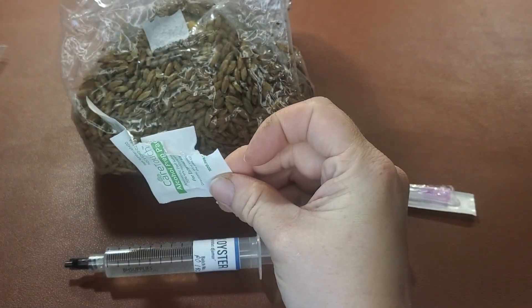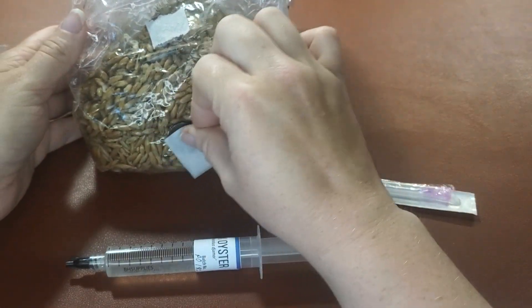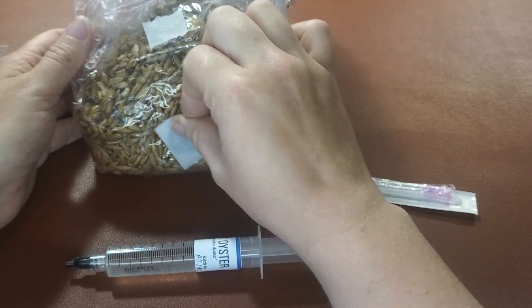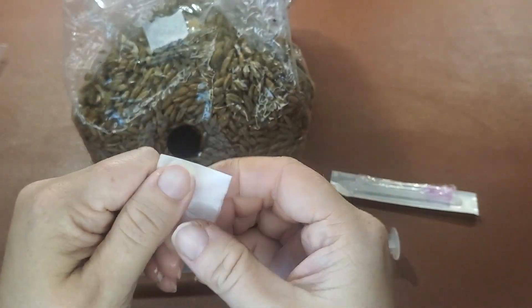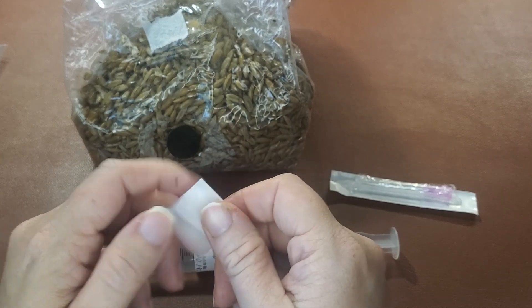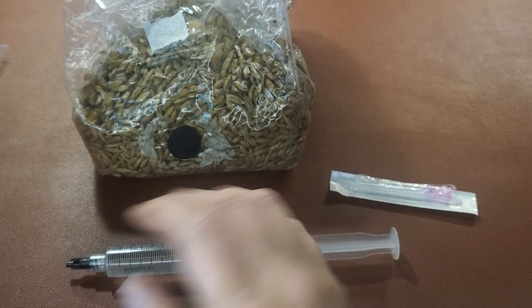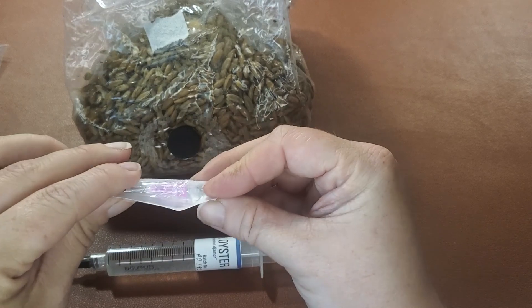We're going to start off with opening this alcohol swab and going ahead and wiping down this injection port. You're going to want to let it sit for about 30 seconds. Go ahead and use a little bit of it to get on your hands. You can use gloves if you want to, but it's not strictly necessary — if you don't have gloves, it's okay. It will still get a good success rate without them.